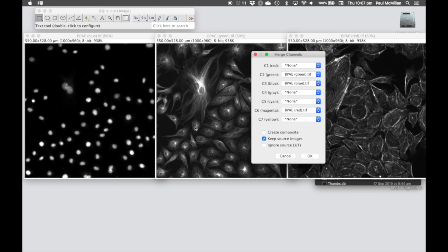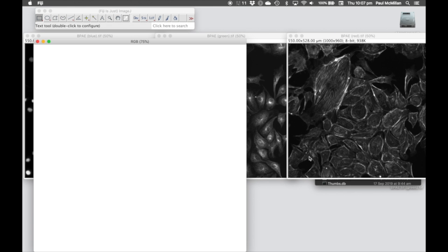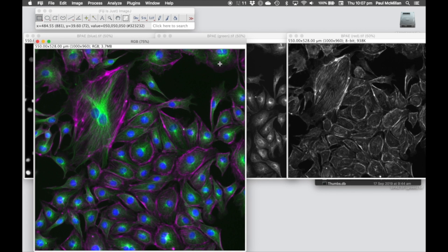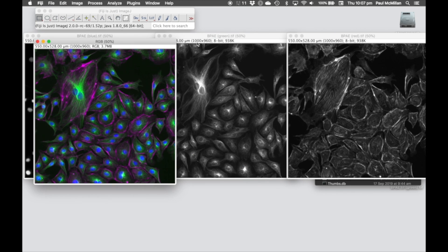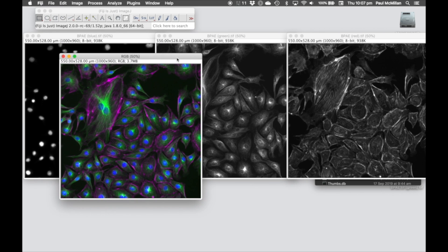You can keep the source images just in case you feel like you're going to mess up. If you hit OK, we now have that blue, green, magenta image that we had previously. It's already an RGB file, so we don't need to infer that.